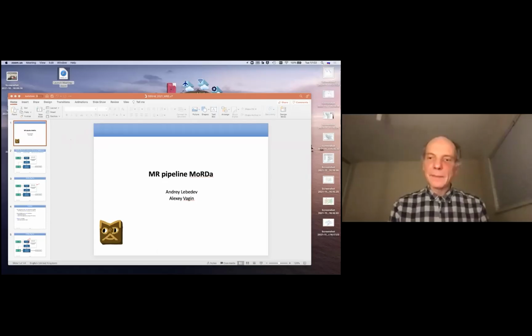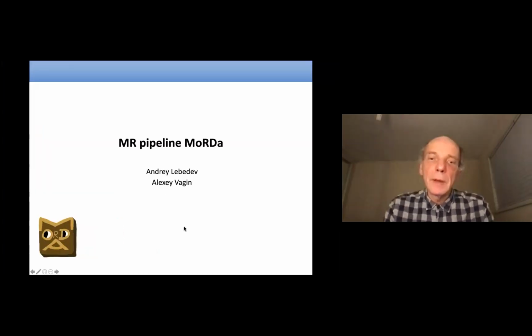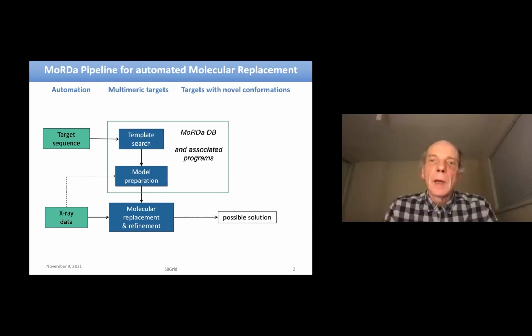Thank you. Hello, everyone. I want to talk today about the MoRDa pipeline for molecular replacement. It's one of many. However, there are several things to highlight here. As any pipeline, it's automation, but also multimeric targets, and importantly, targets with novel conformations.